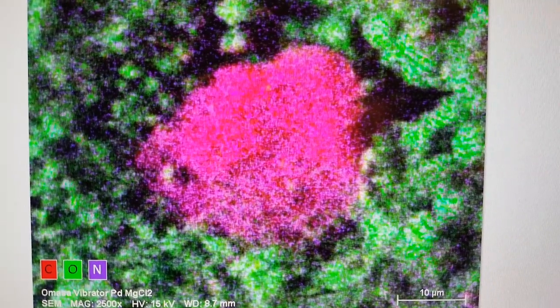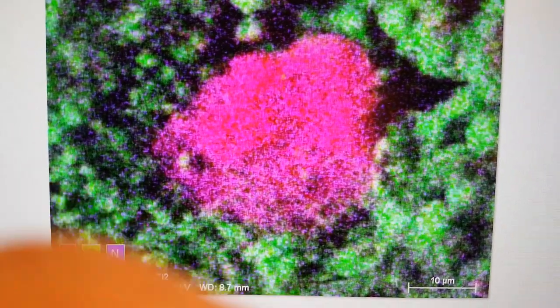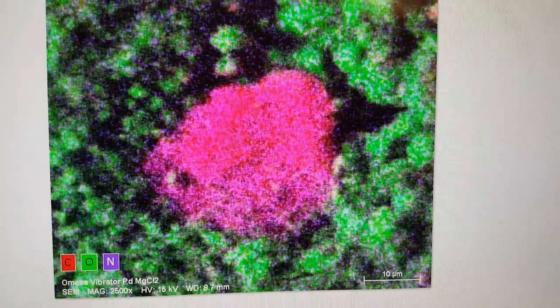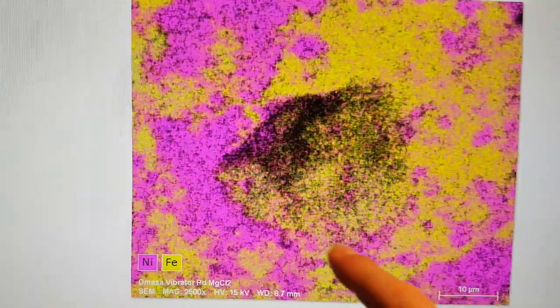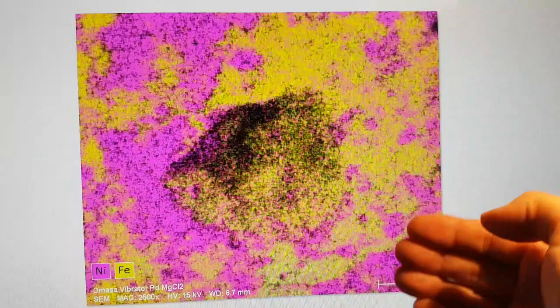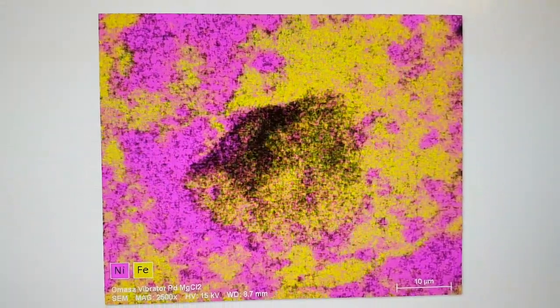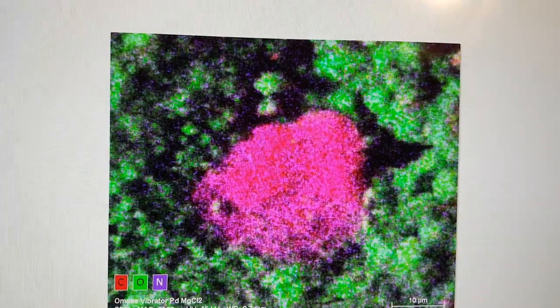Well here we go. So it is predominantly carbon. It's like a clear piece of carbon. It's actually got a reasonable amount of nitrogen in there. The outside here is just oxygen and nitrogen, so there is basically no oxygen on that. So have we synthesized diamond? This is right in the central spot. Is this the kind of thing that Leclerc was talking about? Carbon, he says, and nitrogen and oxygen - they're kind of what you get in a dead star. It's kind of like the end of the fusion chain as far as the star is concerned.